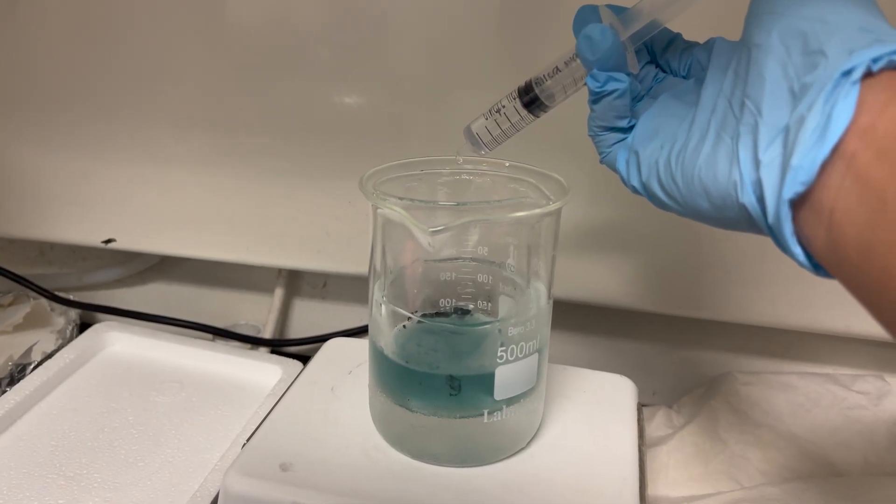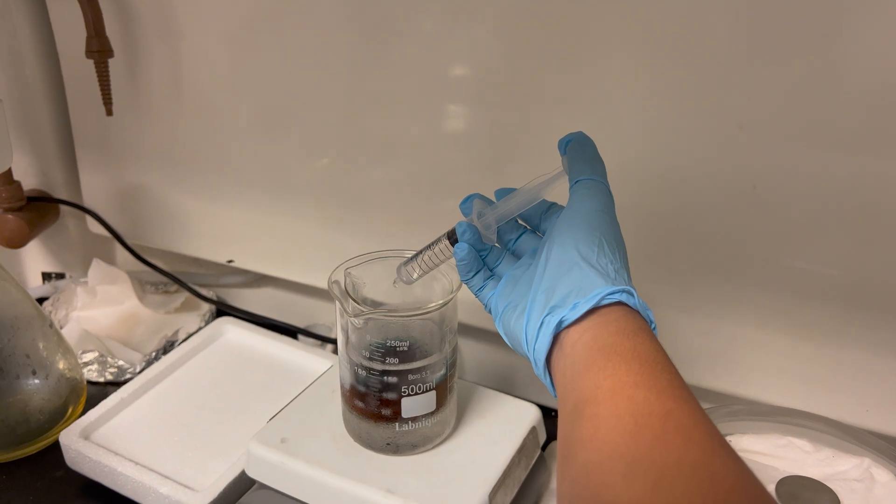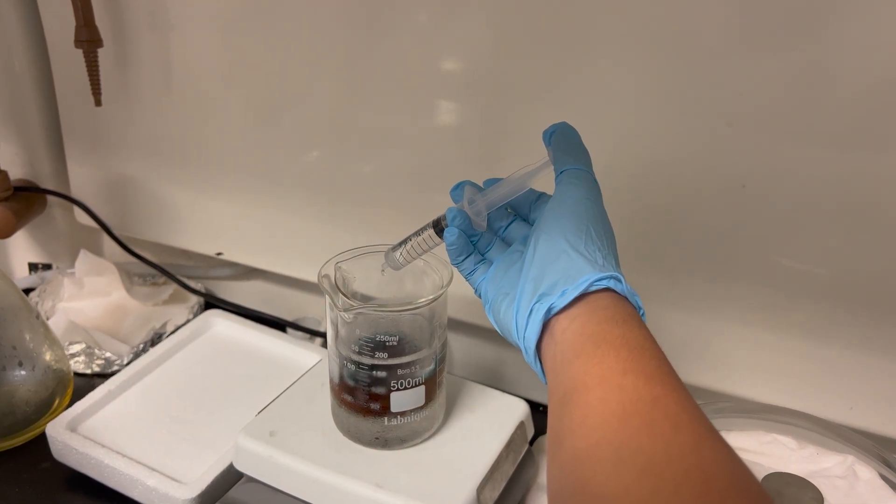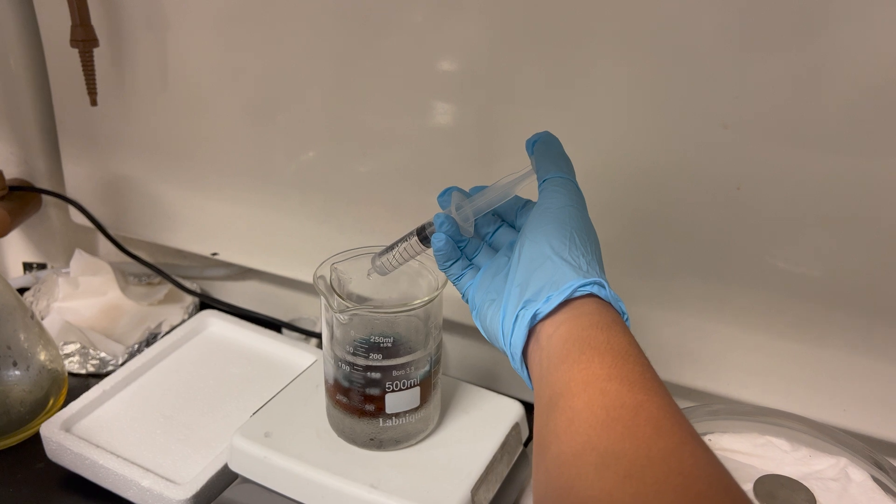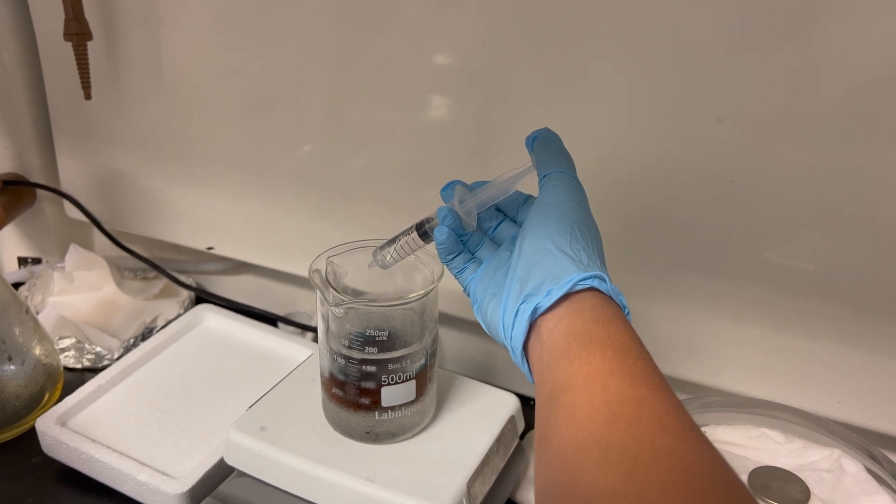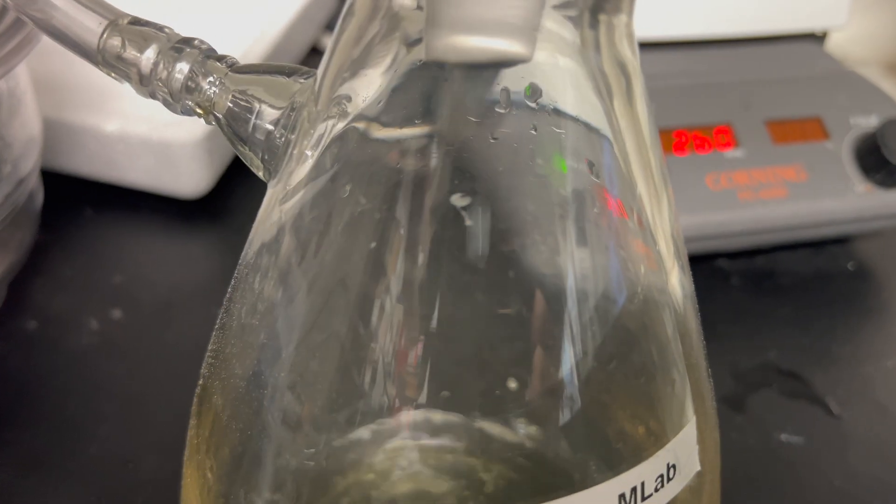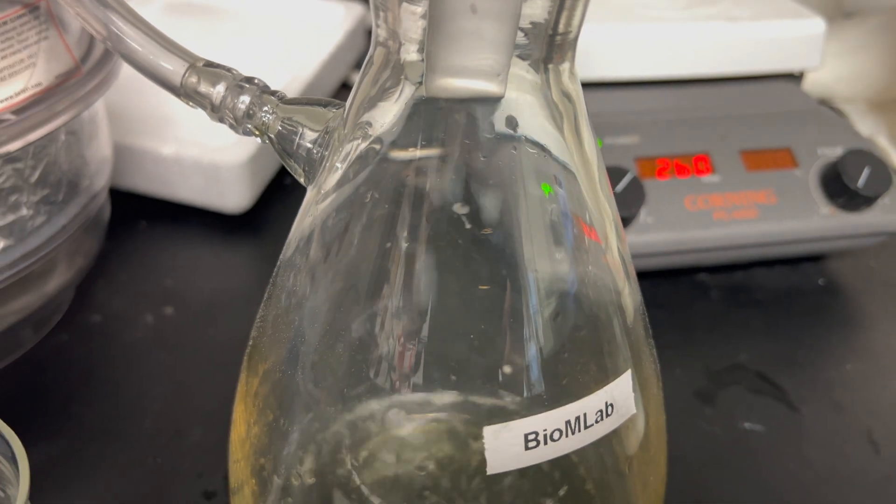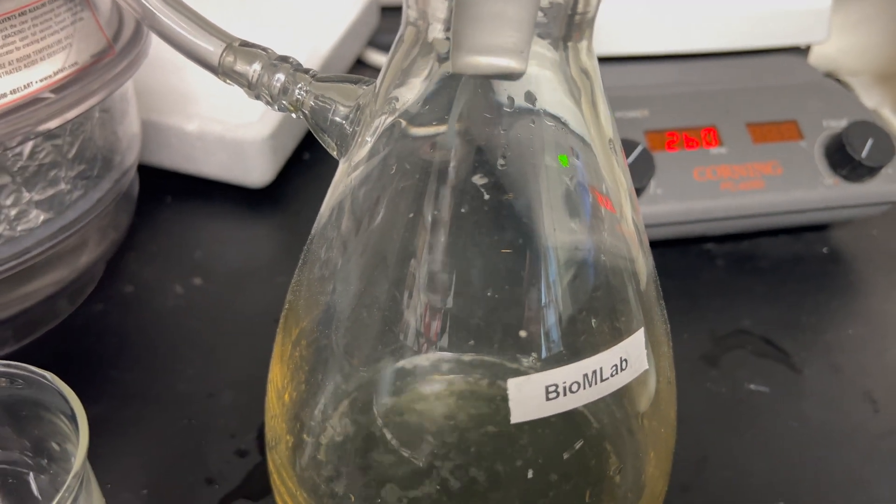Once one hour is done, you can see a drastic change in color. Then we proceed with vacuum filtering the solution. This would also take another hour. Once that is done, we will collect the elastic bands coated with polyaniline.